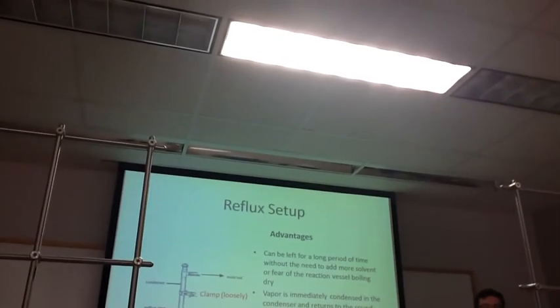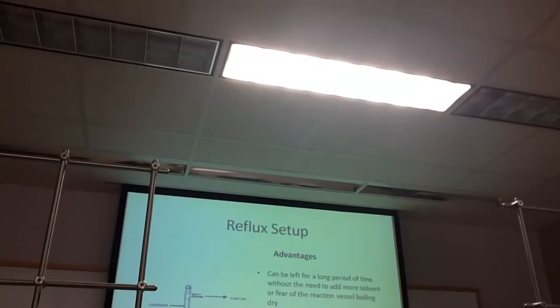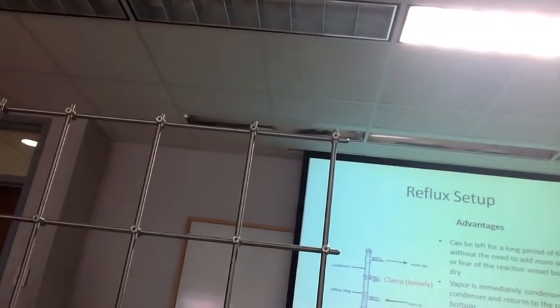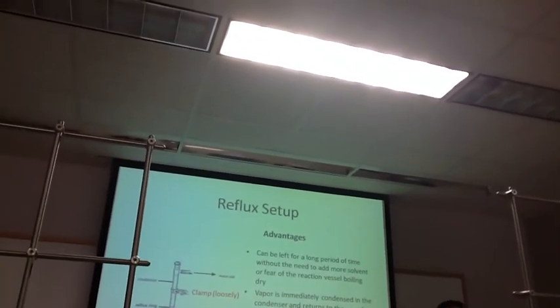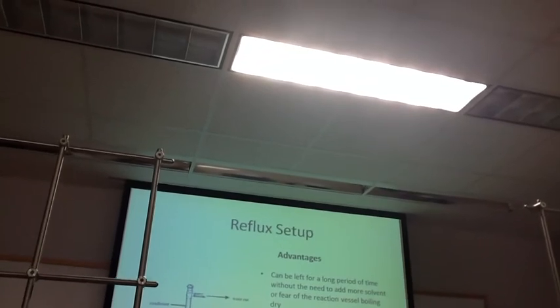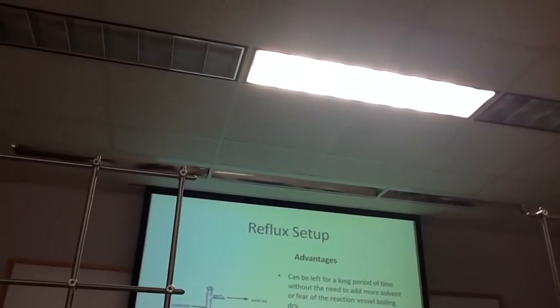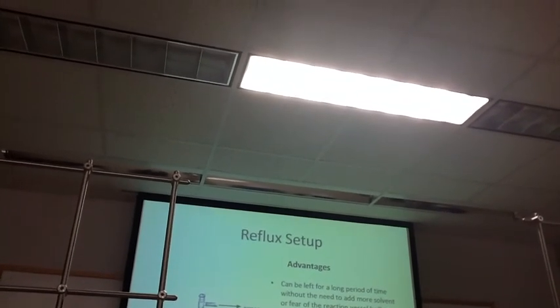Basically, you have a round bottom. Okay, so we've got a round bottom plugged in directly to our ball condenser here. So one thing also to note is you can see how this fits in here. We have some stopcock grease in the back for every joint that you make. So whenever these things come together, put just a little bit of grease on there. And remember, a little bit goes a long way, so don't go spurting this everywhere and getting it all over your hands because it's never going to come off. So just make sure you put a little on there, and it's going to help hold this seal in when we're doing the reflux.